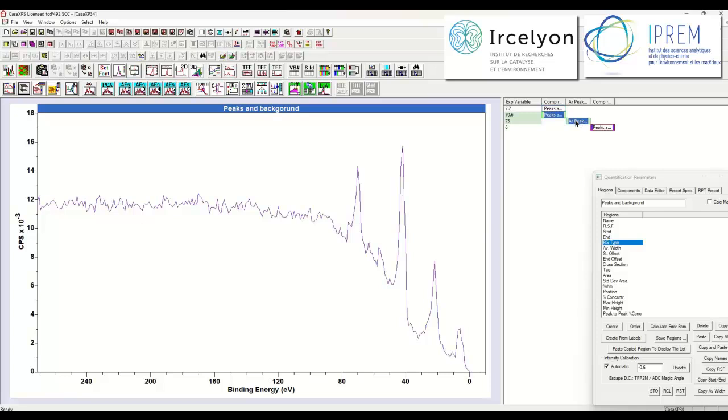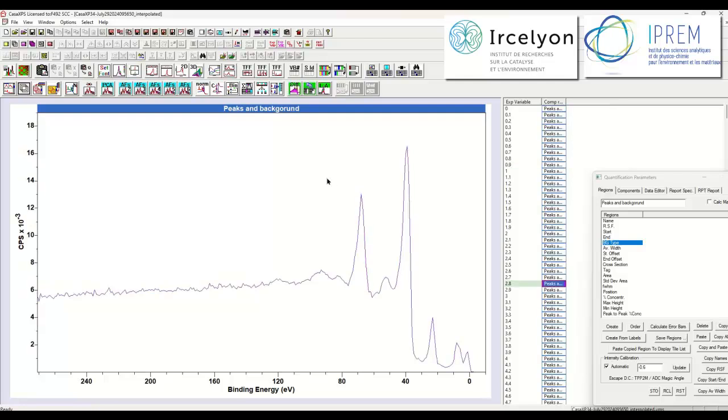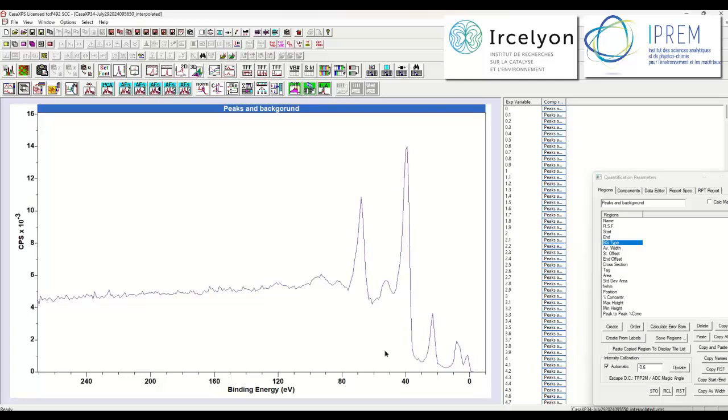So now I need to do the same operation based on the second oxide. It's not so obvious there's metal here, but if there's metal in the first one, there might be metal here in the second one. So let's do a difference calculation and see what happens when we remove metal signal. And I'm watching this part of the spectrum, and I can see that it is changing, and when I go too far, I can see it has gone too far in terms of removing metal from the sample. So let's go up until we get a shape that looks plausible for an oxide.